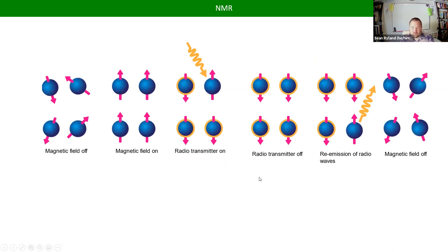And to give you an idea of how strong these magnetic fields are, even for something not as big as an MRI machine, an NMR that you would use in an orgo lab might be roughly the size of a desk. And there have been cases where you turn one of those on and you have a chair made out of metal in the same room, and if it's an old machine that wasn't well shielded enough, you can actually wind up destroying your NMR because you drag your metal chair into the NMR at high velocity. So we're talking about very strong magnets.